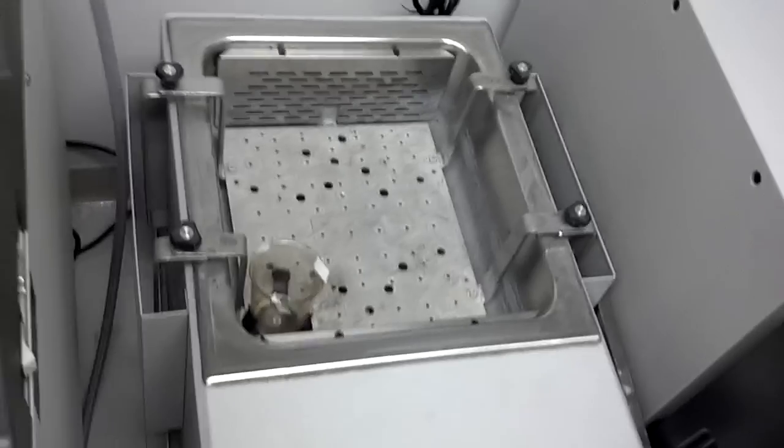This is another water bath I'm going to use. These are autoclave bottles.